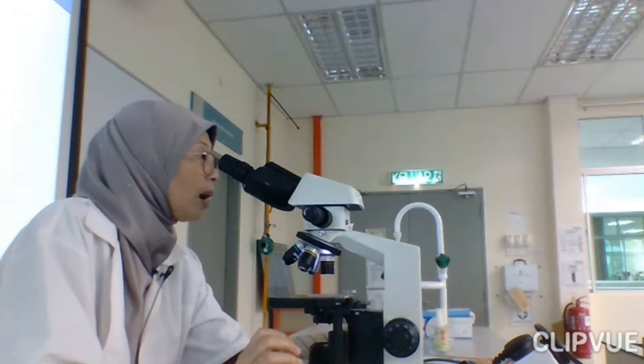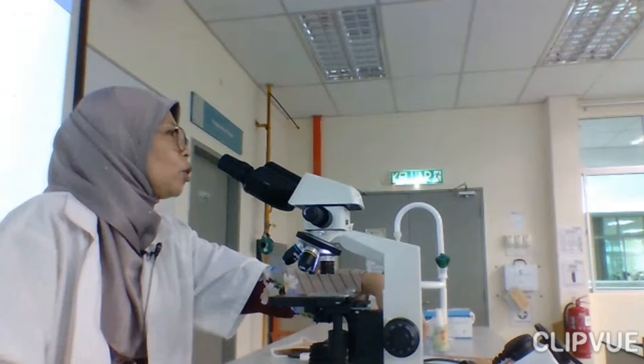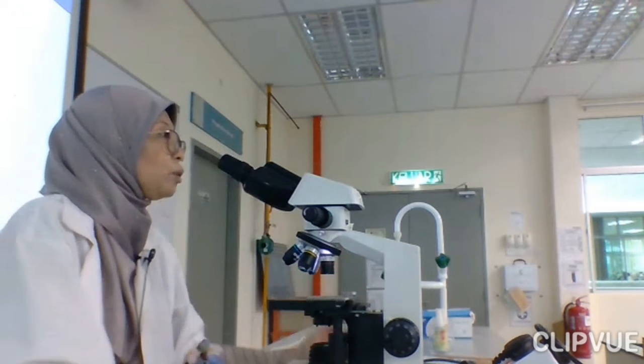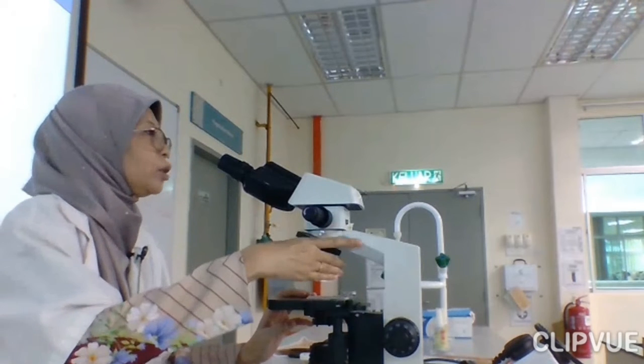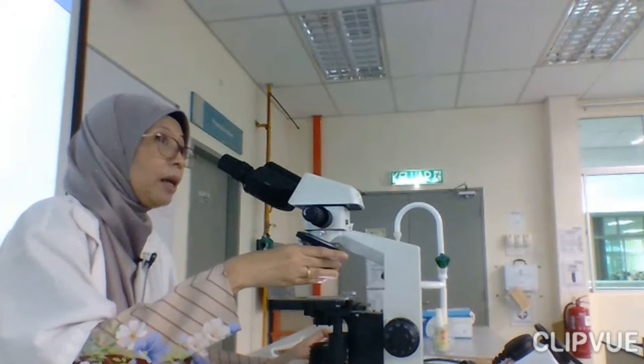So now, before you start observing anything, make sure that the mechanical stage is at the lowest position. Make sure that you turn it anti-clockwise until you can't turn anymore, so it's at the lowest. And you start with the four times. Now, the objective lens.